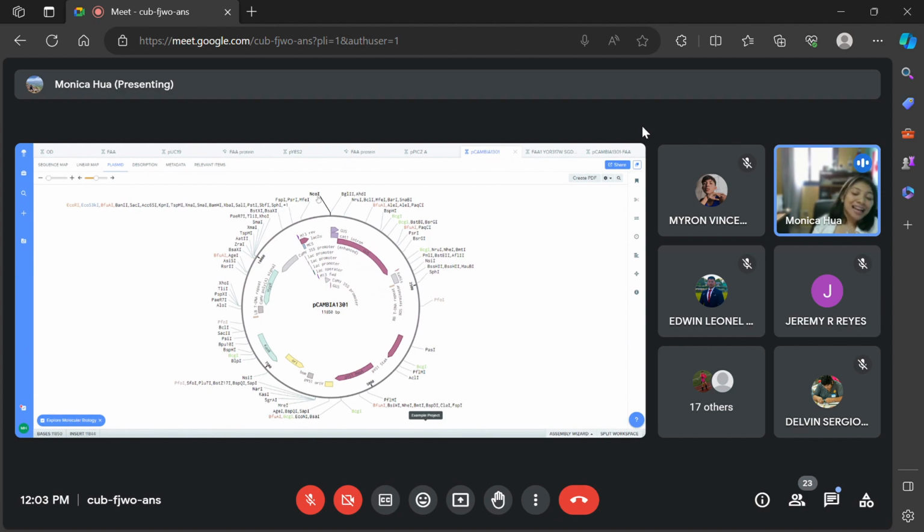Your sequence has a stop codon, meaning if you insert it into this area, you will need to remove your stop codon so that translation can continue to produce the Gus protein that should be expressed in plant.